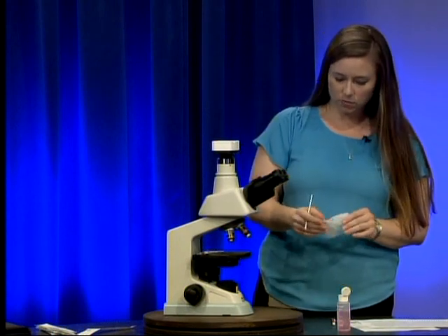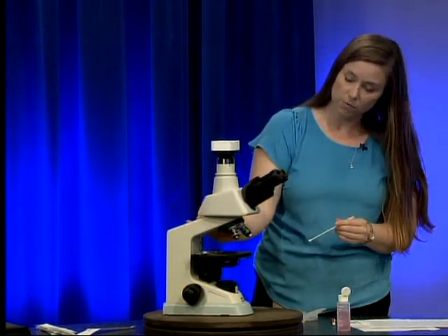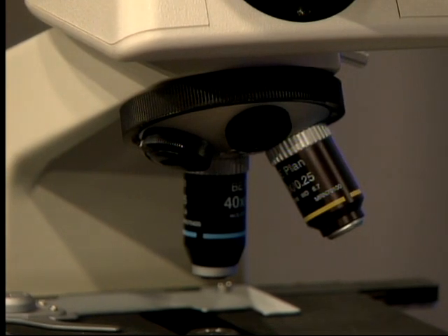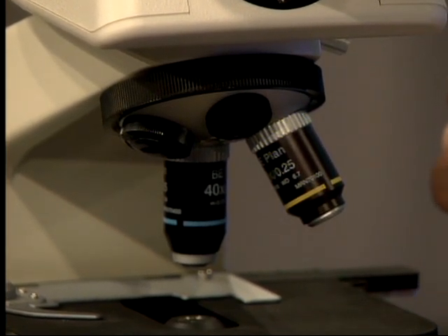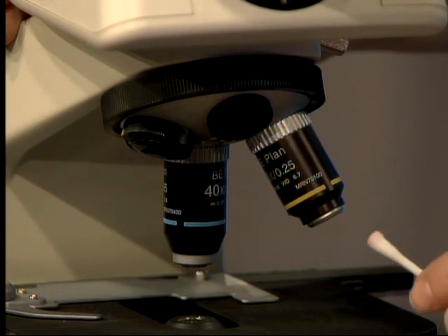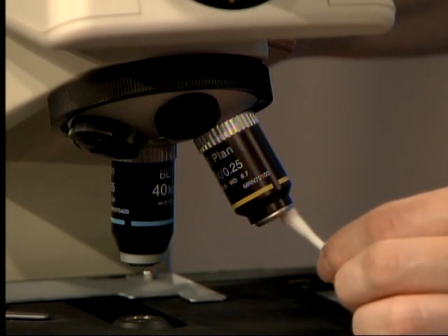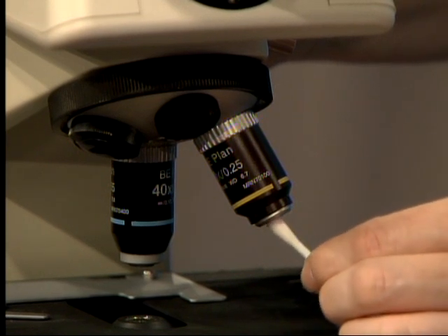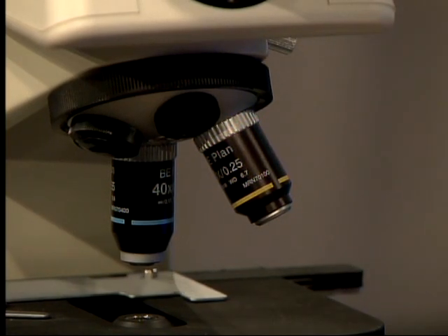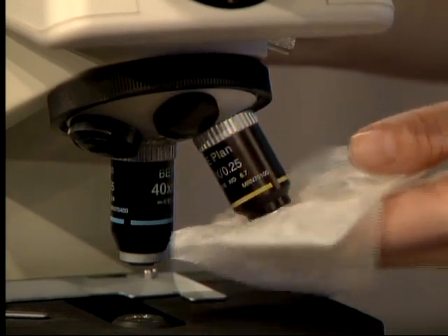The next area to clean is the objectives. Turn the revolving nosepiece ring and rotate it so you can easily access your objective. If your stage is up close, you may want to rotate it downward for better access. Take your moistened swab and clean the lens at the end in a circular fashion. Also clean the metal edge in case anything corrosive has gotten on it. Then take dry lens paper, pat it dry, and give it a small rub to remove all liquid.